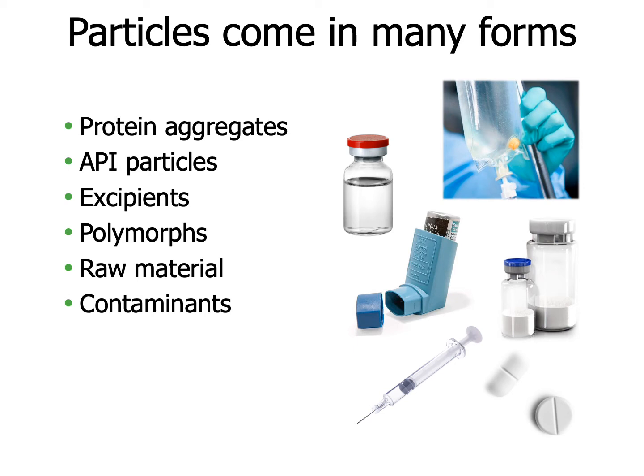This poster is about analyzing particles in different types of forms. Particles come in many different stages of biologics drug development. Sometimes they are wanted and expected, and sometimes they are unwanted. So we're going to talk about ways to characterize both.